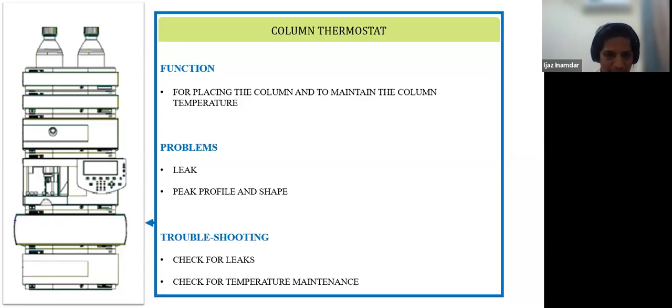The other part I'm not talking about is the detector. Now, the detector can be anything. As I said, my column inlet is this, my column output is this. So I can connect this column output directly to an LCMS part that we'll talk about. Or I can connect the column output to my UV detector, and then the UV detector output can go into the mass spec. So I will get UV data as well as mass spec data.